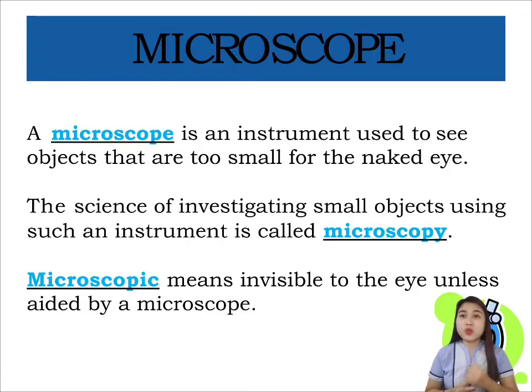Okay, next, what is microscopic? Yes, Ella. Not visible to the eyes unless aided by a microscope. Very good. So it is the object that uses microscope for us to see it, or to see those small objects or the microorganisms.